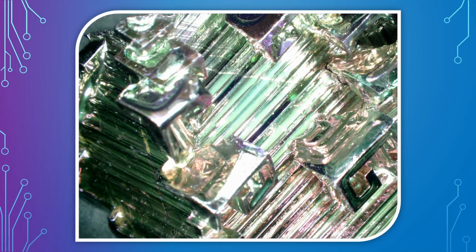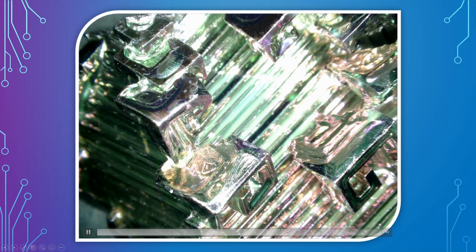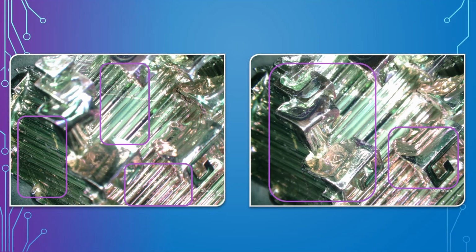The data that we'll be using, that we recorded at McMaster, is of a bismuth sample. In this video, we're actually tuning the focal length of the microscope on different portions of the sample. So starting out, we're here at the back, and gradually we go to the front to focus on the top of the crystal closer to the camera. Here we have two images that we've extracted from that video, and you can see what portions of the image are in focus and not in focus. And we'll be using a total of 4 of these images at different focal points to make our combined image.